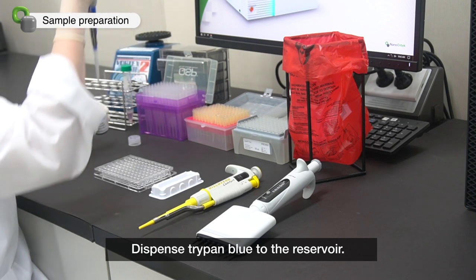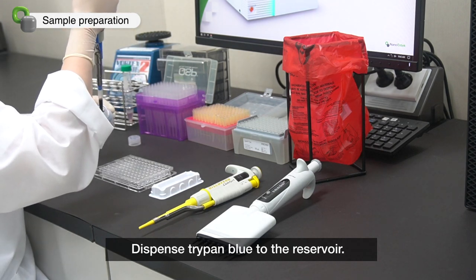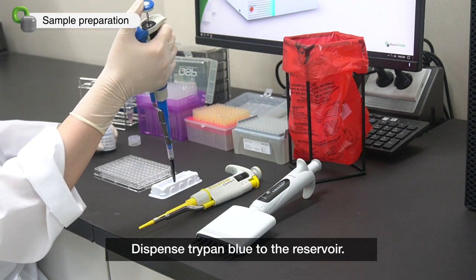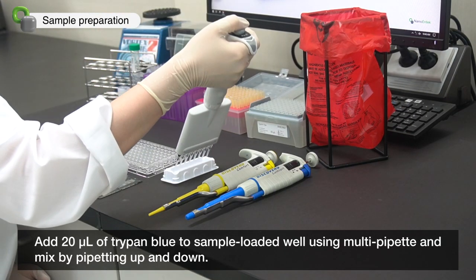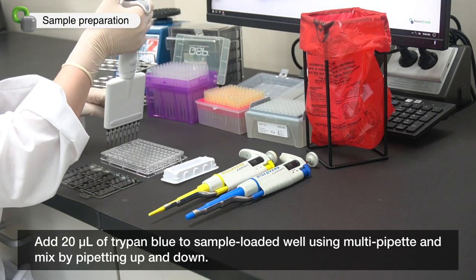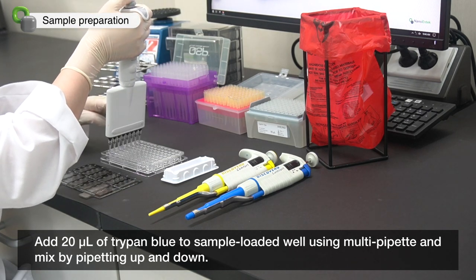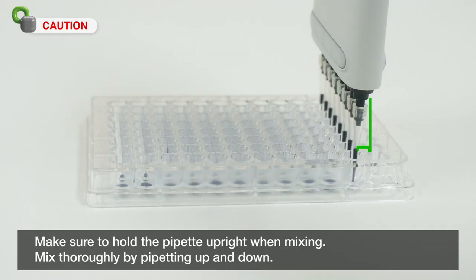Dispense trypan blue to the reservoir. Add 20 microliter of trypan blue to sample loaded well using multi-pipet and mix by pipetting up and down. Make sure to hold the pipet upright when mixing.